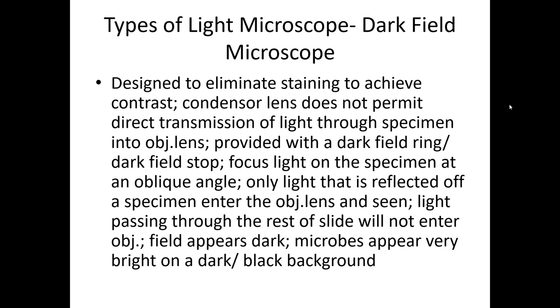Is it clear? Yes, I got one answer. Maunia, Shalini, yes. Does anybody have any doubts in bright field microscope? Anybody? Priyama Kumari, thank you. Any doubts in bright field microscopy? Because once you understand bright field microscope, the rest is all easy for you. There will be some slight differences from the microscope, that's all. Clear? So with your consent, I am going to the second type of light microscope, dark field microscope.